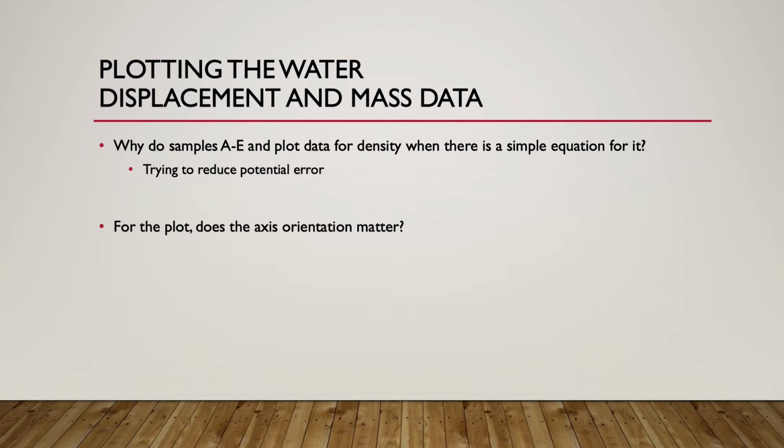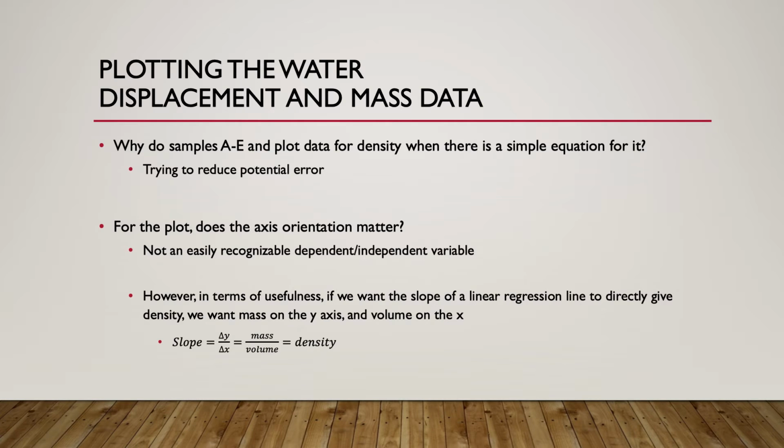Now, when you're making the plot for your data and you're actually making your Excel plots that you'll be uploading to CSE Pub, axis orientation does matter. So keep in mind, even though for this particular case there's not an easy dependent or independent variable for you to recognize between mass and volume, the thing that's important to us is we will eventually want to find density.